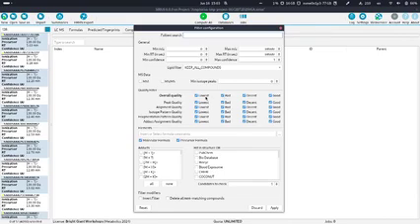And what is often a good idea, the lowest is really something which we are thinking about just kicking out. So this is really something where, for example, there's not much measured or something is very wrong with your data. So it might be a good idea, before you do any computations, to just throw all of these features out anyways. And to do this, you can, for example, just deselect this checkbox here for the lowest overall quality. Now we have not selected anything else, and we will just click on apply.